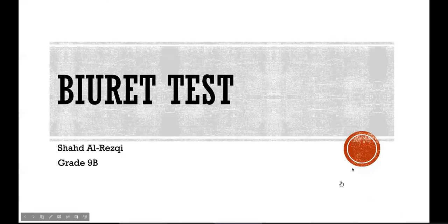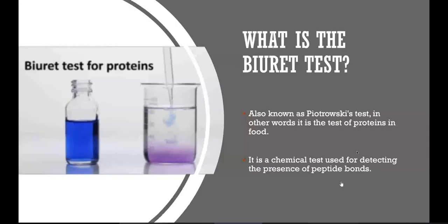Bismillah. Assalamu alaikum, everyone. My name is Shahad Rizqi, and today I will be showing you my attempt in conducting the Biuret test. I first want to go through what the Biuret test is very quickly, so you can have a little understanding of what I'm doing in the next couple of slides. The Biuret test is a chemical test which is used for detecting the presence of peptide bonds, so many people would use it to check whether proteins are present in a solution or not. It's also known as Piotrowski's test.